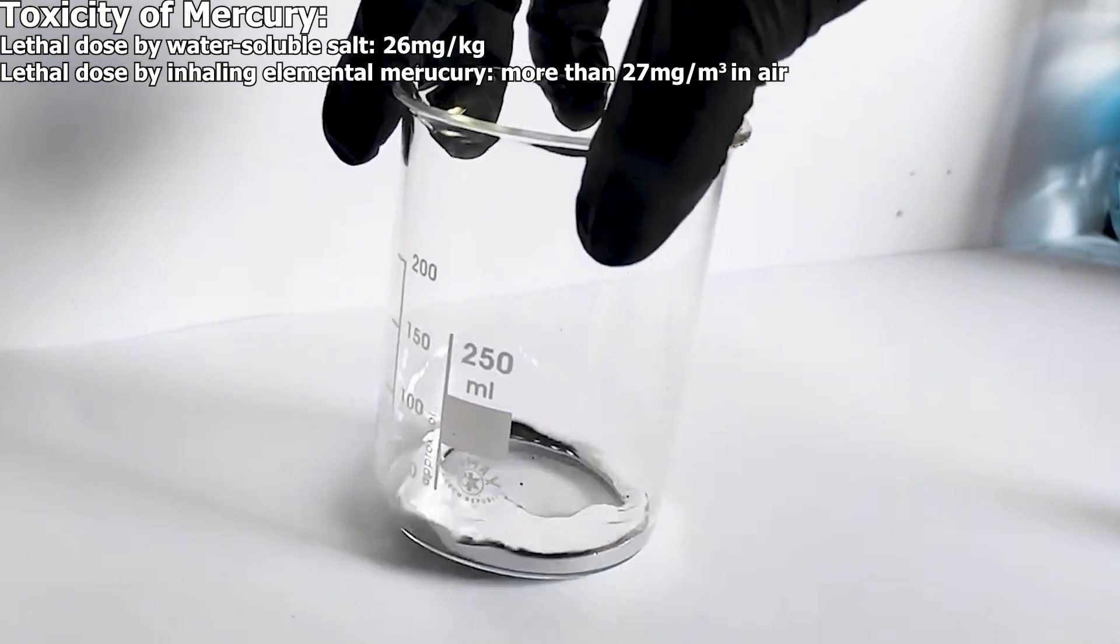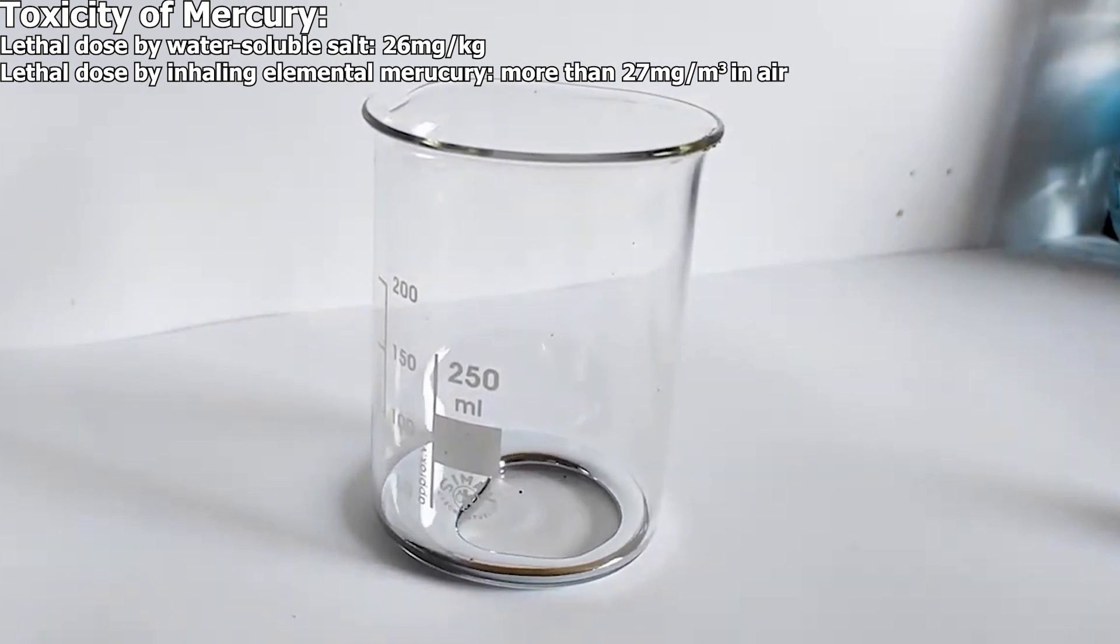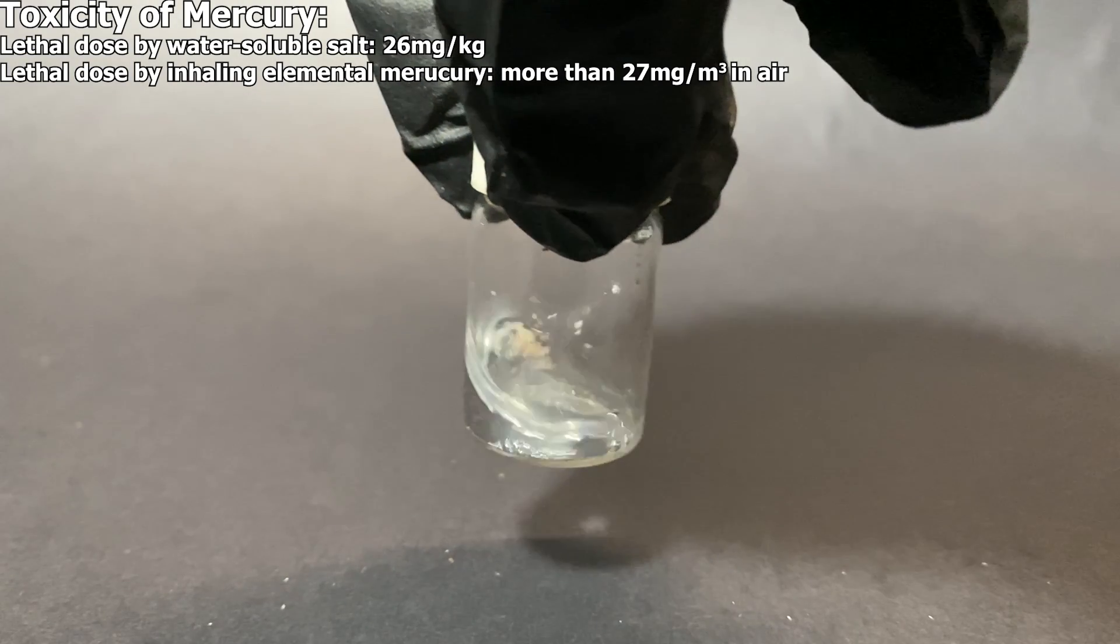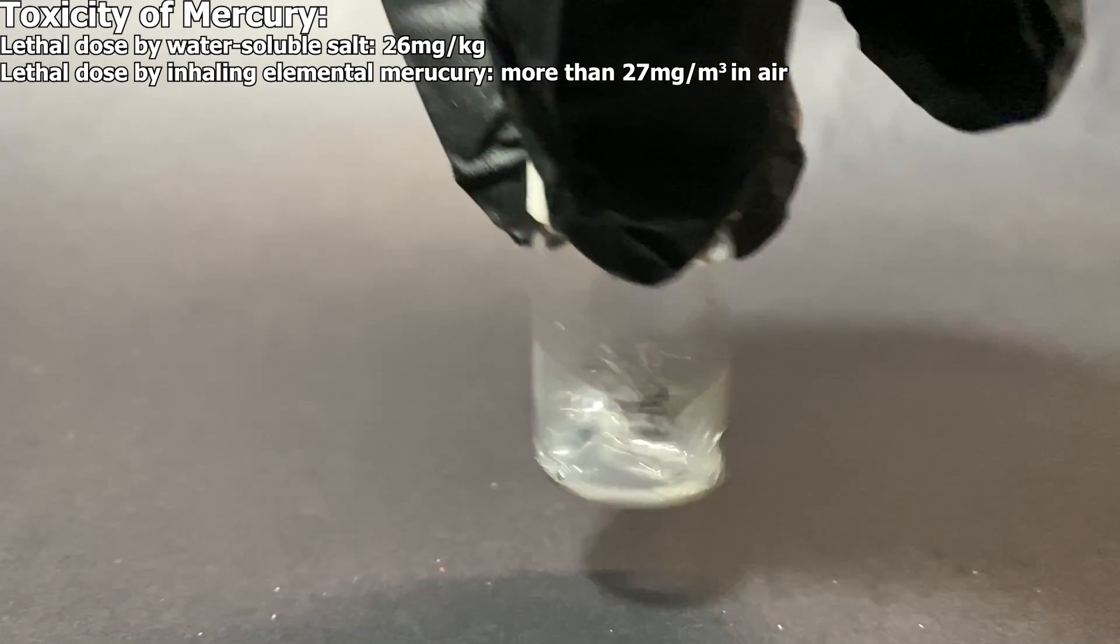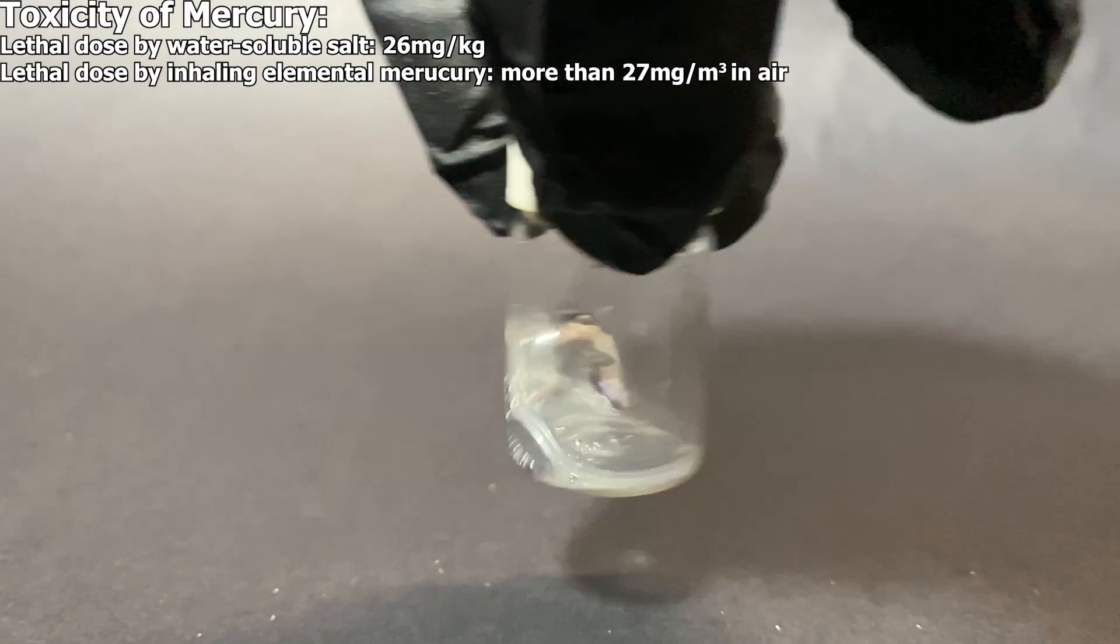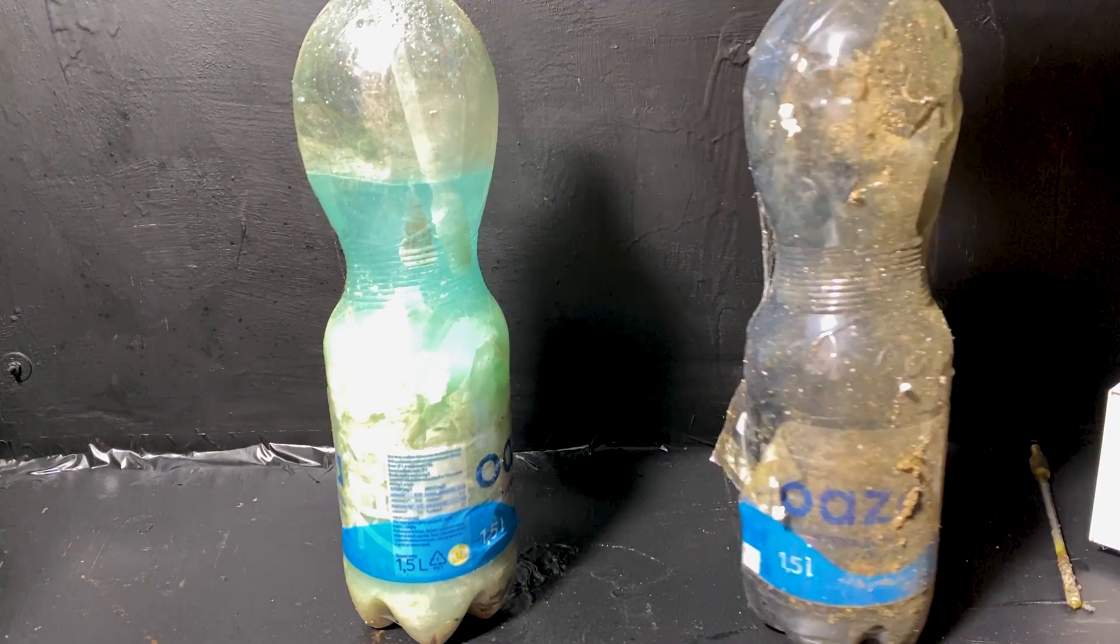Mercury is extremely toxic. In fact, on the screen you should be seeing the average lethal dose for mercury and its salts. And thus it can't be poured down the drain or dumped into the environment, because first that's illegal and second you can directly poison many people. So I store the mercury waste in these two plastic bottles.